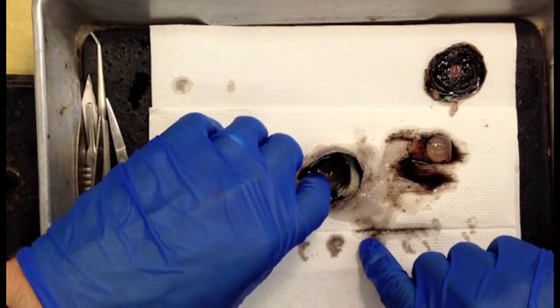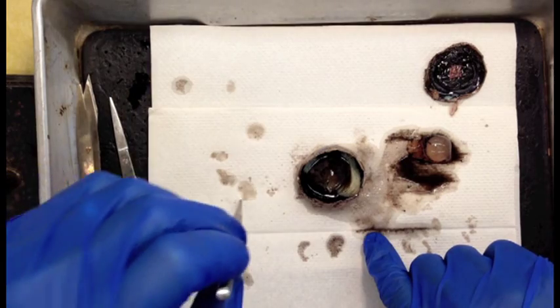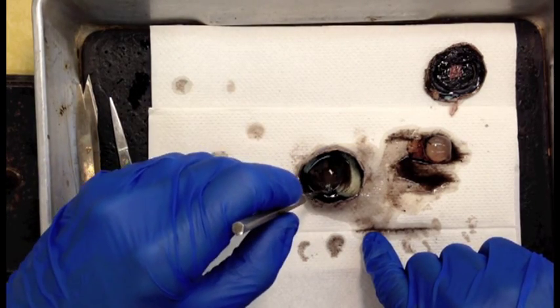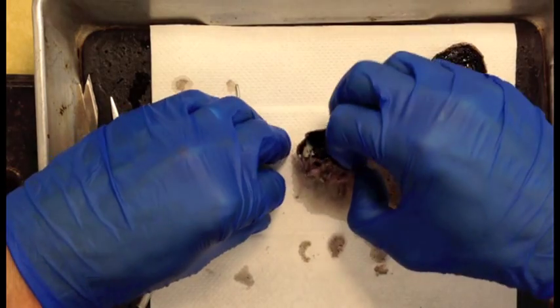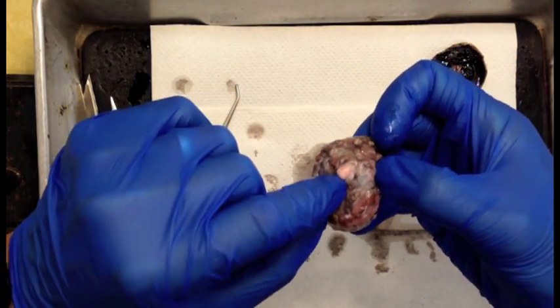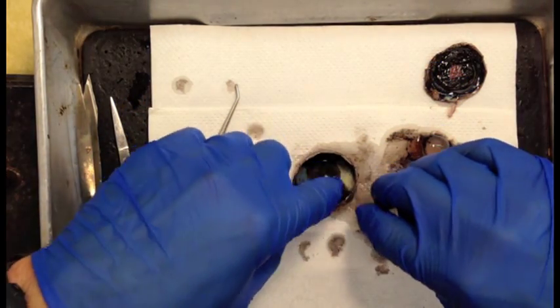And as soon as you cut into the eyeball, the retina actually detaches from the wall of the eye. But there's one part where it's still attached, and you can see it right in this region right here at the end of the probe is where it's attached. And that portion is actually the very beginning of the optic nerve. So I'm going to go ahead and flip it over and show you that optic nerve on the back again. And you can see the optic nerve here, this sort of cream white, and that lines up perfectly with where the retina is attached to the eye.